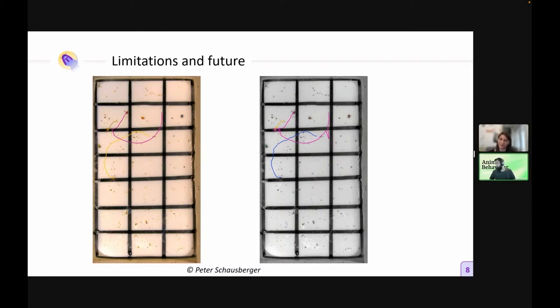So we receive another message from Raphael Durshade. I hope that I said it properly. Do you have any statistics on how often the tracking ID might accidentally switch between animals, swapping animals A and B by accident? Well, I'm afraid it's not really possible because it depends a lot on your video.